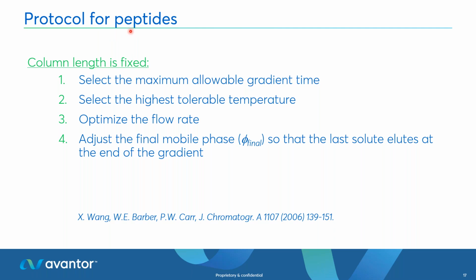So we will know as separation scientists, as chromatographers, that selectivity is key for optimizing your resolution. So please tune and optimize that column selectivity in your column selection decision. So you've really made that empirical and best decision for which column you're going to enter and start this protocol for maximizing your peak capacity.